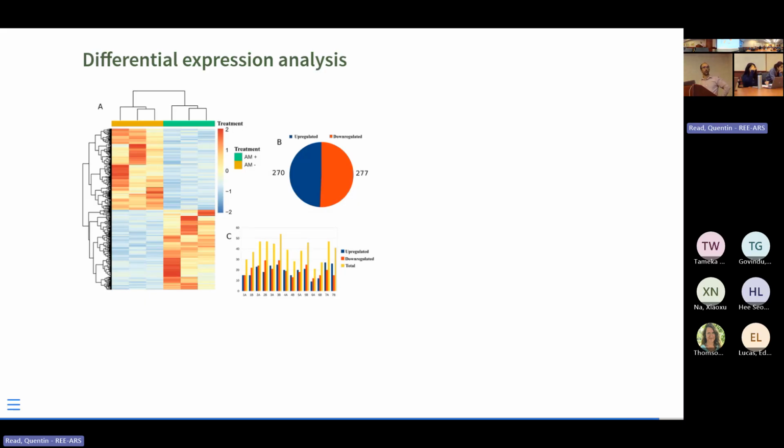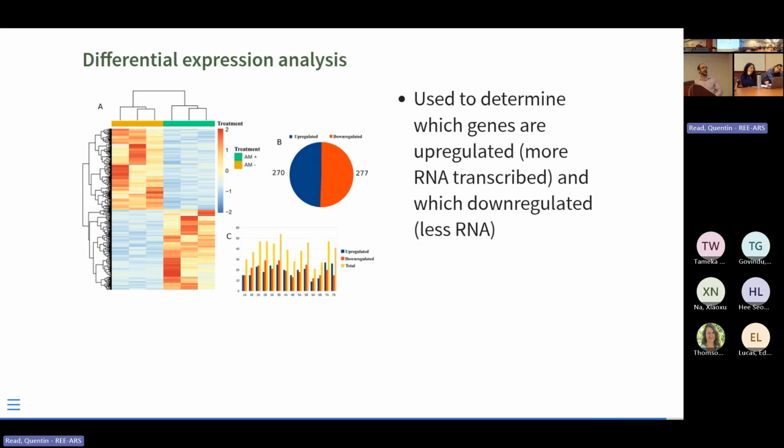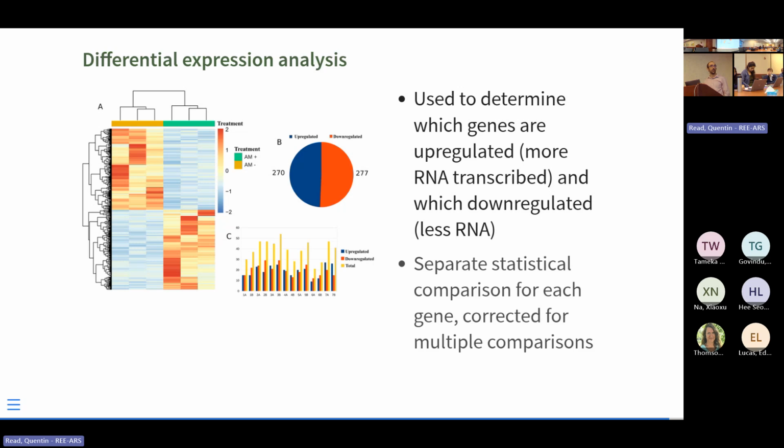Another important thing to look at is differential expression analysis, but it can be used for other types of omics as well. We're going to talk about this in our single omics analysis that we're going to do today. It is not exploratory. It's actually a hypothesis testing approach where we say, okay, these genes are significantly higher expressed or upregulated or whatever it is in the treatment group versus the control group. That's basically what we're doing.